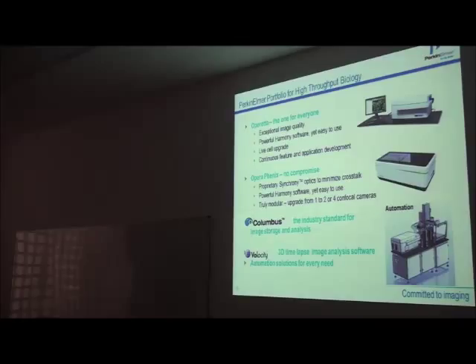Columbus is the next step, because you have to think about data storage. You have 2 terabytes in the computer, but if you do live cell imaging, every image is 2.5 megabytes per image, per channel. So if you do a measurement like we did this morning, we are probably at 300 megs for every single experiment. If you multiply it by the number of channels, the number of planes, because you can also do it in 3D, and by the number of time points, then you see. So your next question will be data storage and data management.